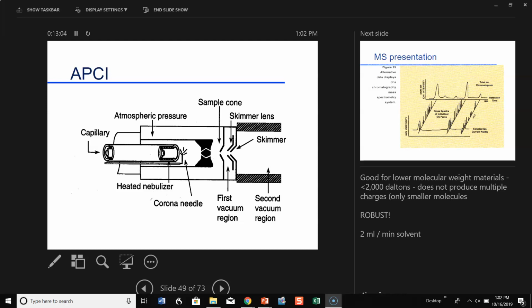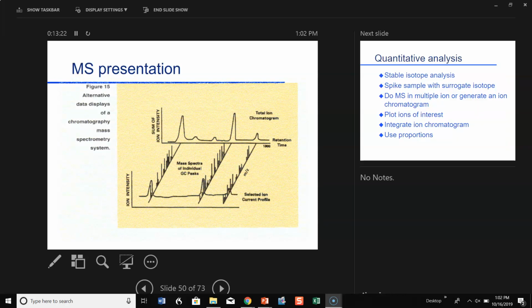This is one that's used fairly commonly for gas analysis. You know, we'll see them on hot air balloons going up into the stratosphere, following pollution in Los Angeles or wherever else, because it's really a nice system for that. You can simply draw air in and measure pollutants in the air. I'm going to show you what I use it for in a little bit. I use it a little differently.